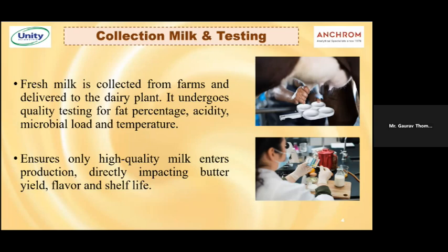Milk being a raw material for various types of dairy products, such as cheese, milk powders, butter, buttermilk and many more, the fat content and the protein content have to be checked and monitored properly.